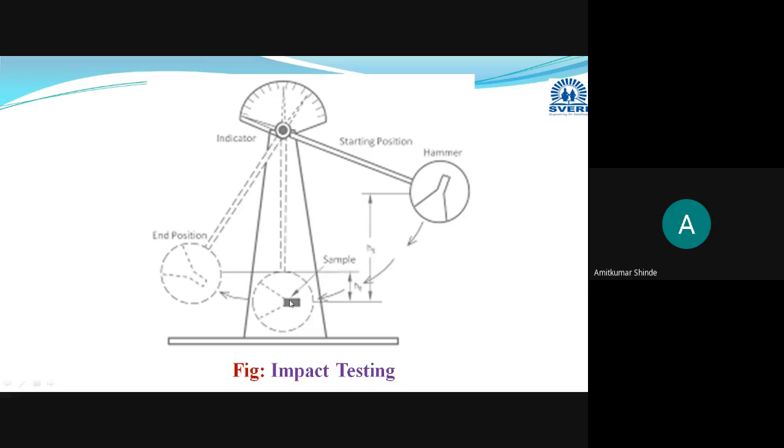Okay, and the failure of the component will occur, and the amount of energy that the particular specimen will absorb before the failure, here the failure will occur due to the tensile and impact. Okay, due to this impact, tension will get created in the specimen. That's why this amount of energy absorbed will be termed as the tensile impact energy.